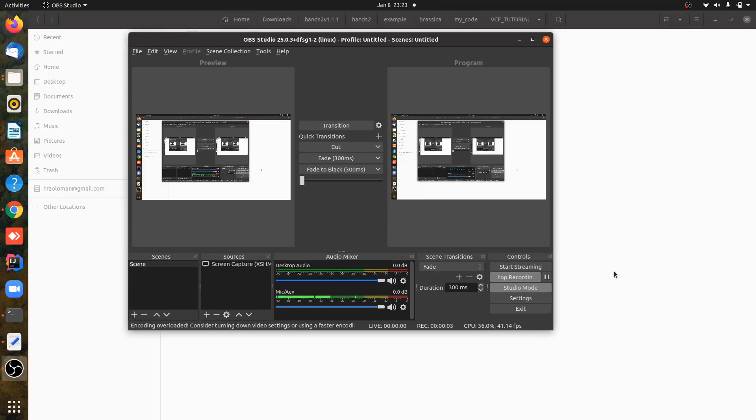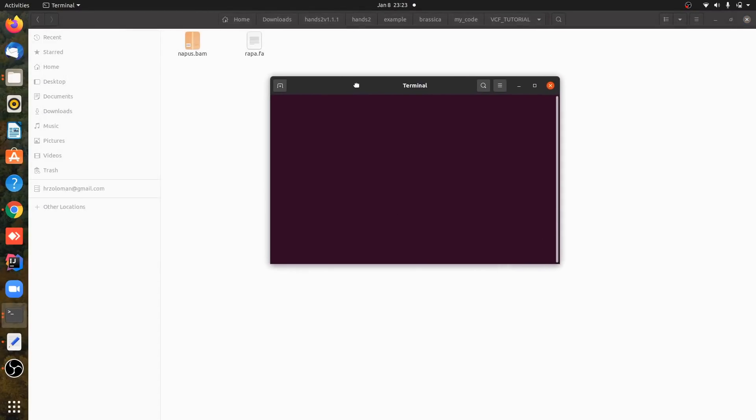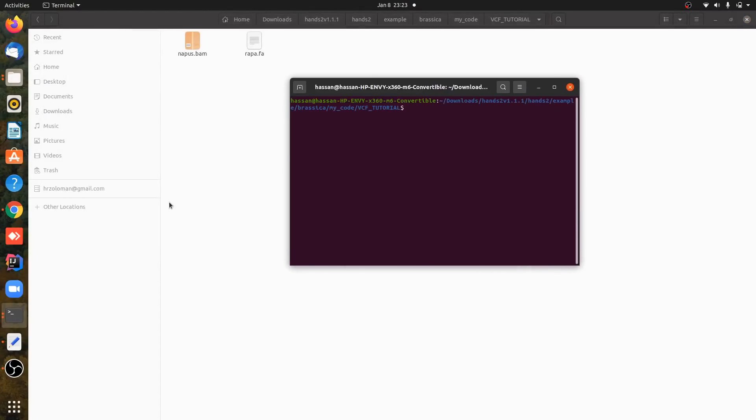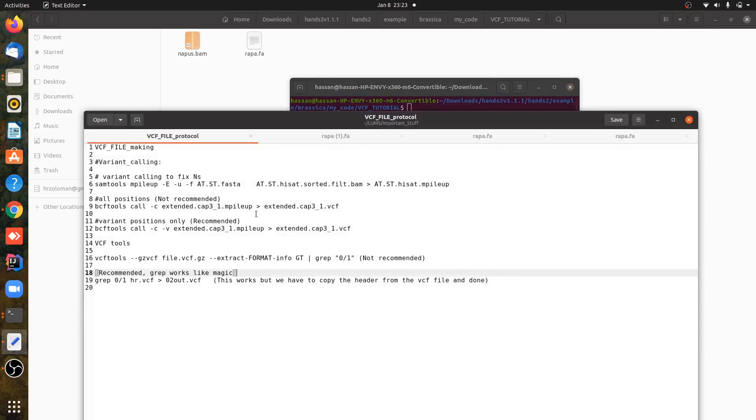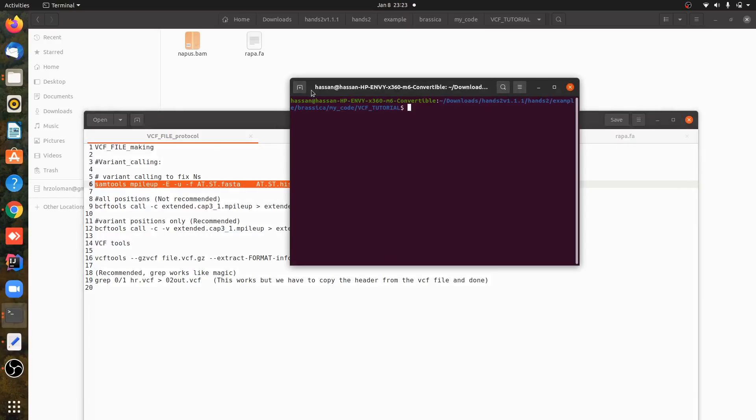Hello everyone, so today we will learn how to make a VCF or variant calling file using samtools. First of all, you have to open your terminal and then I'm copying some commands to call variants. You have to paste this command.